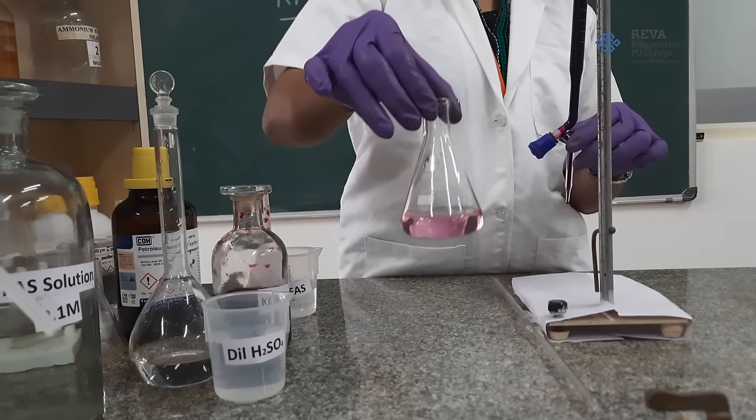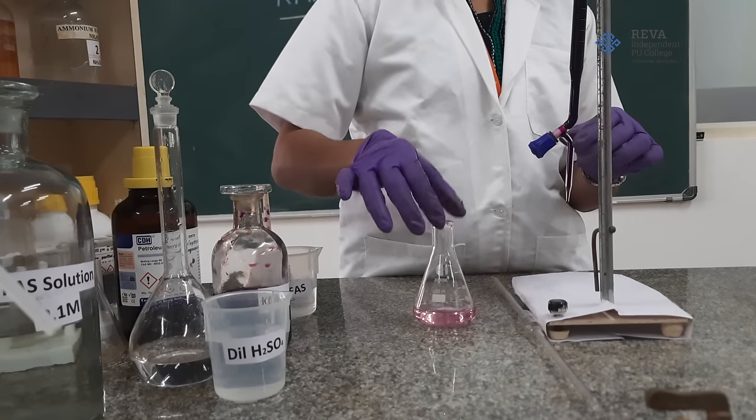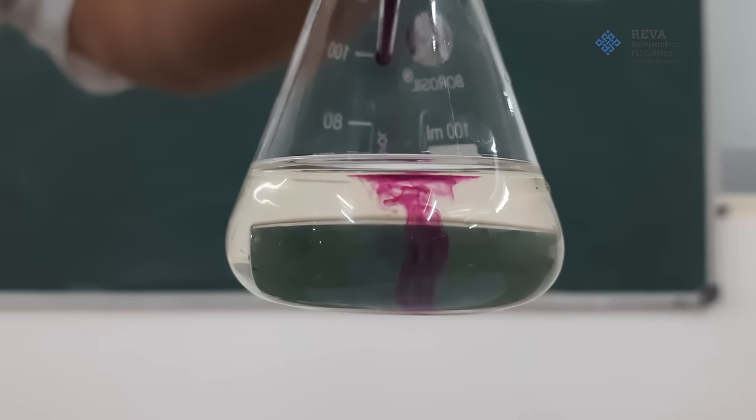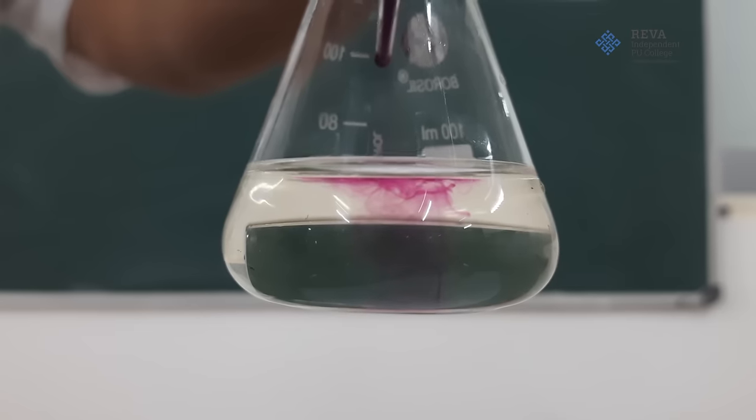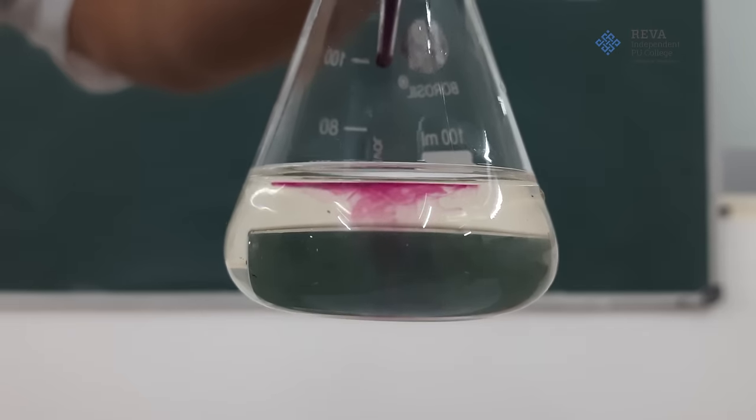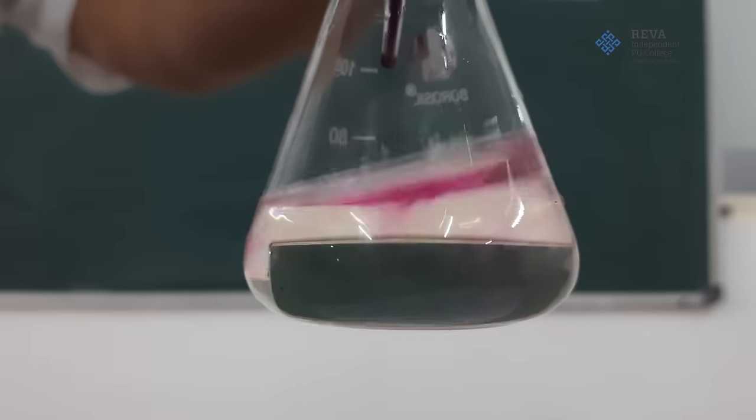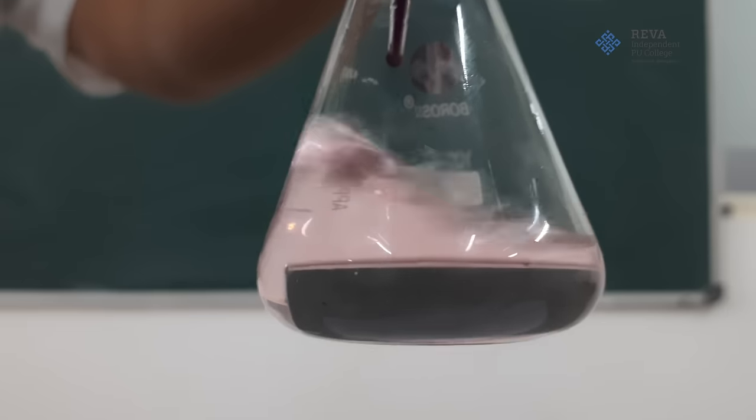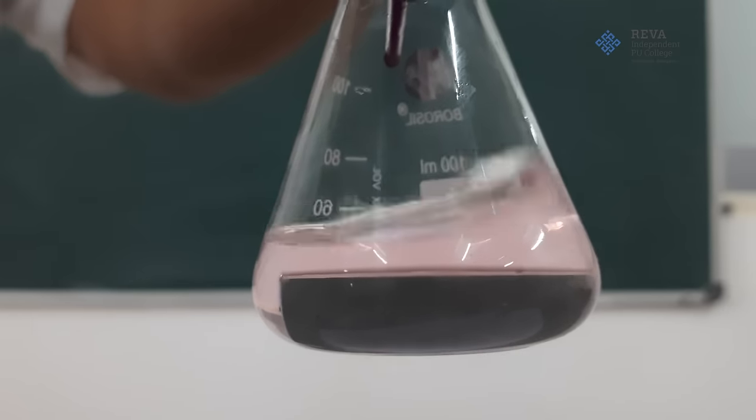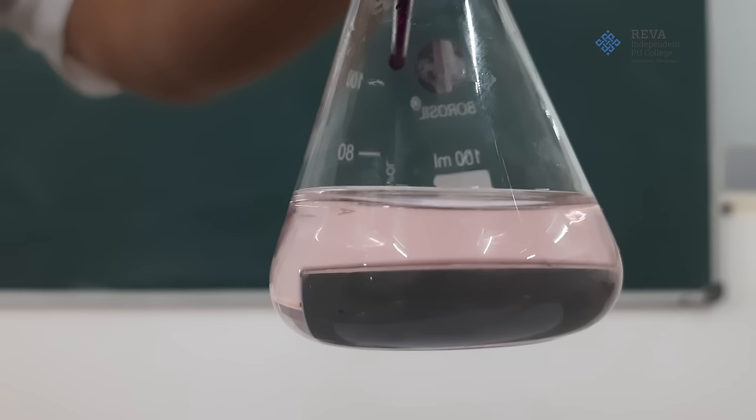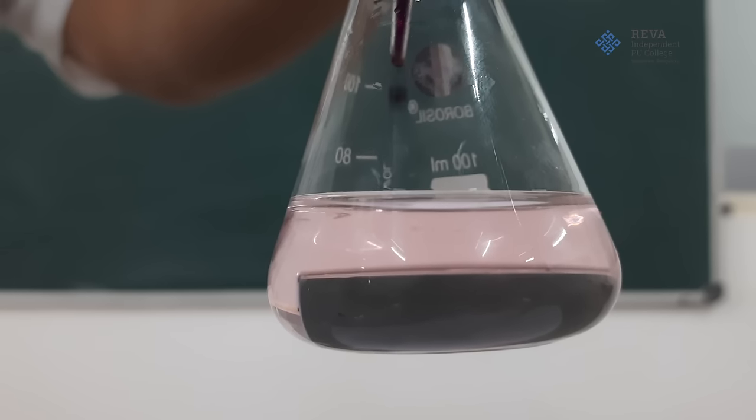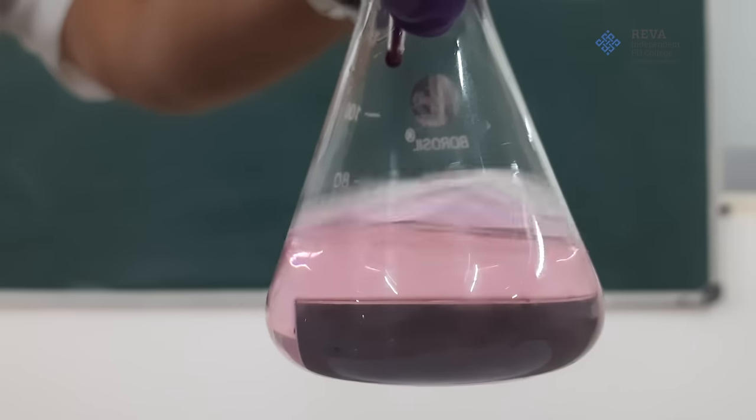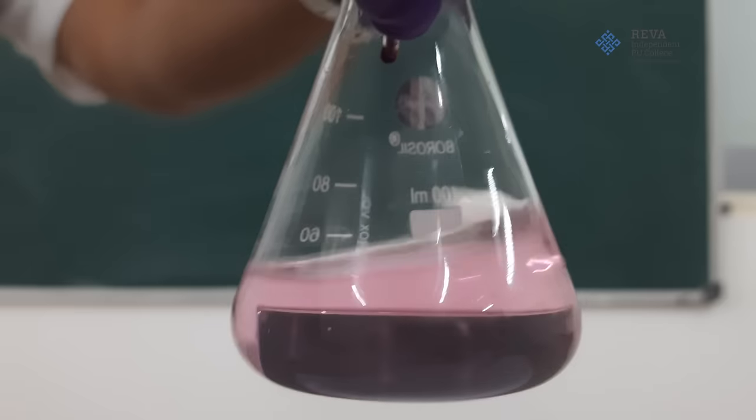This indicates the end point of the titration. Appearance of permanent pale pink color is due to excess drop of potassium permanganate which is not reacting with ferrous ammonium sulfate indicating that all ferrous ammonium sulfate is used up. And no more to react means all ferrous ion is converted into ferric ion indicating an end point.